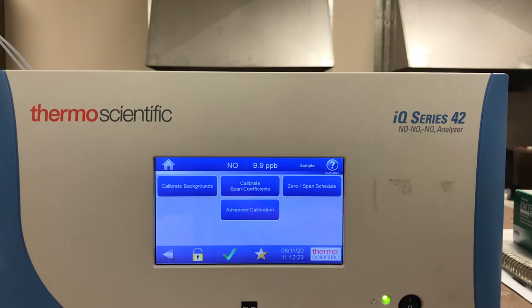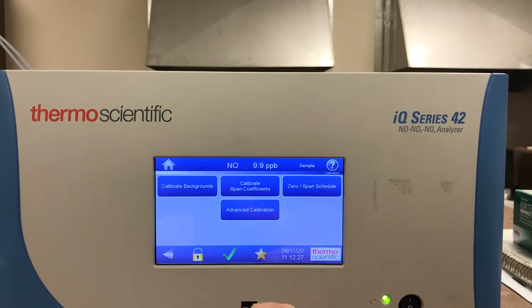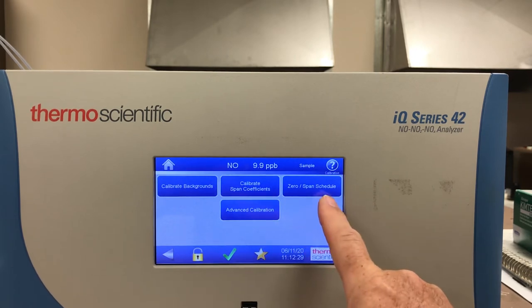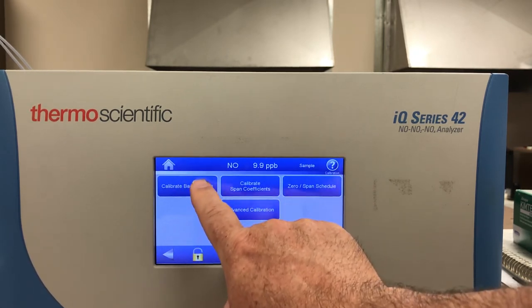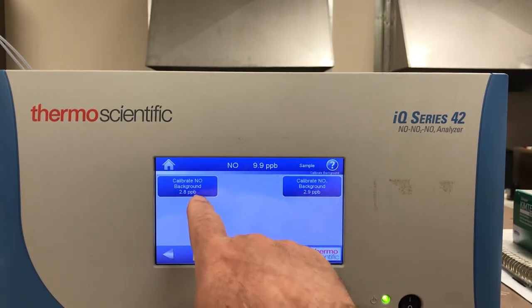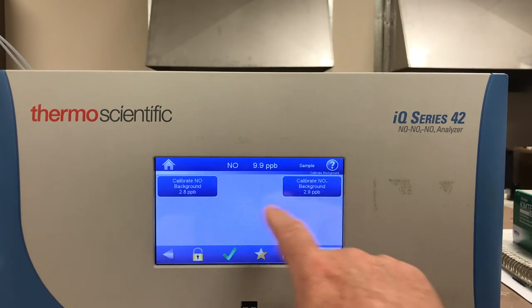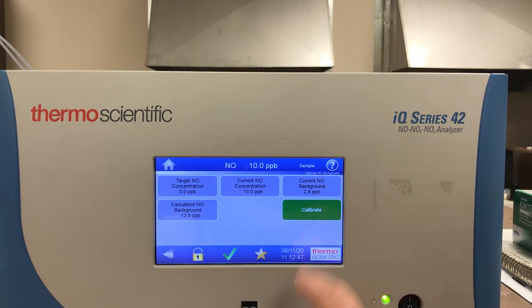...the first thing I see is: calibrate backgrounds, calibrate span coefficients, and there's also an advanced calibration and zero/span schedule. If I'm going to do the background adjustment, I simply touch cal backgrounds. Since it's a NOX analyzer, it gives me a choice of calibrate NO and calibrate NOX, so I can press calibrate NO.